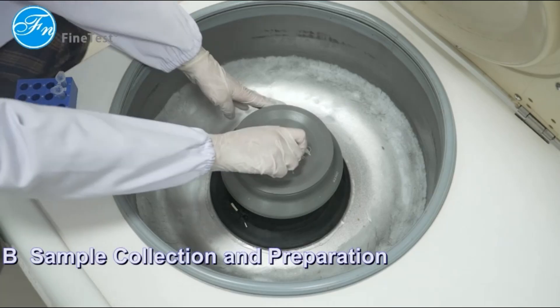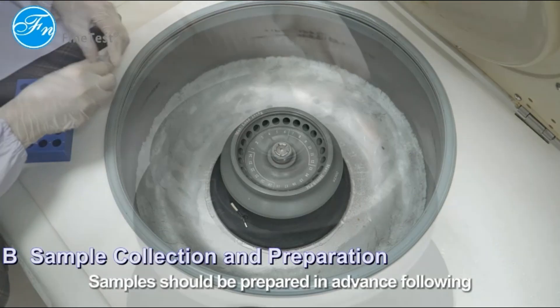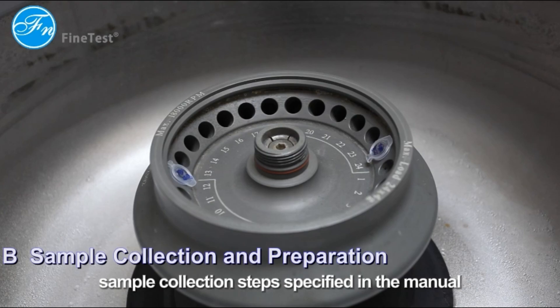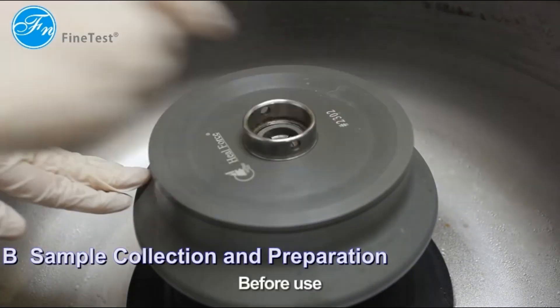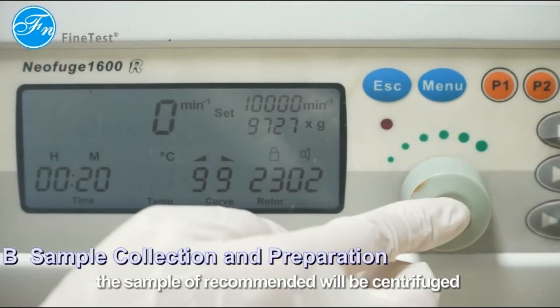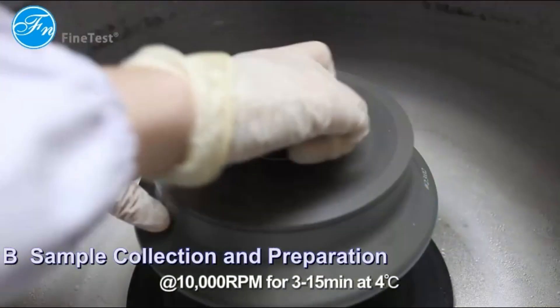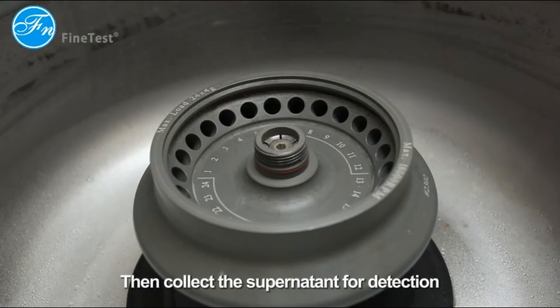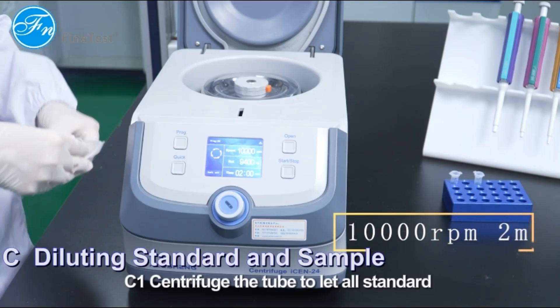Sample collection and preparation: samples should be prepared in advance following the sample collection steps specified in the manual. Before use, the sample is recommended to be centrifuged at 10,000 RPM for 3 to 15 minutes at 4 degrees. Then collect the supernatant for detection.